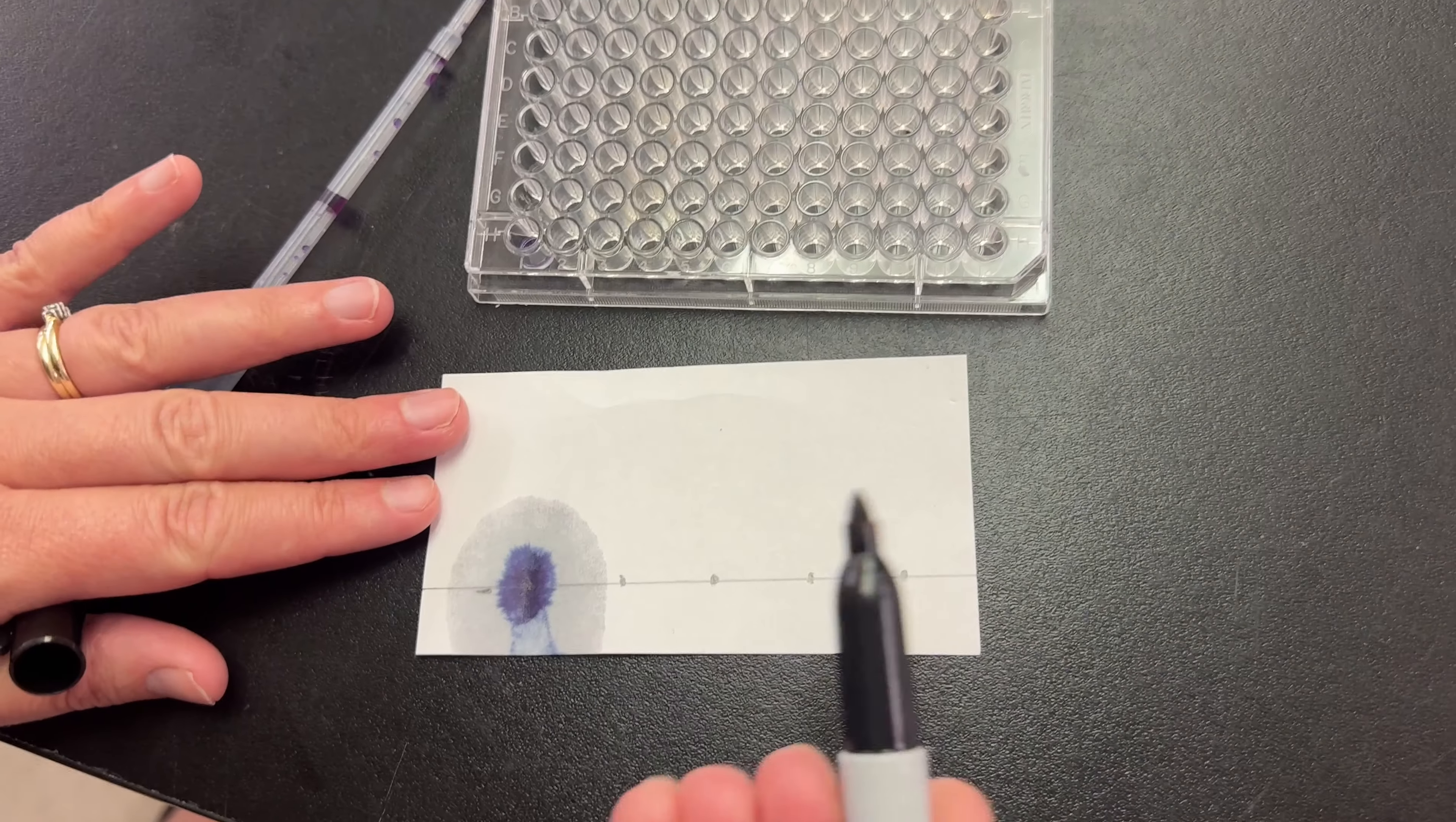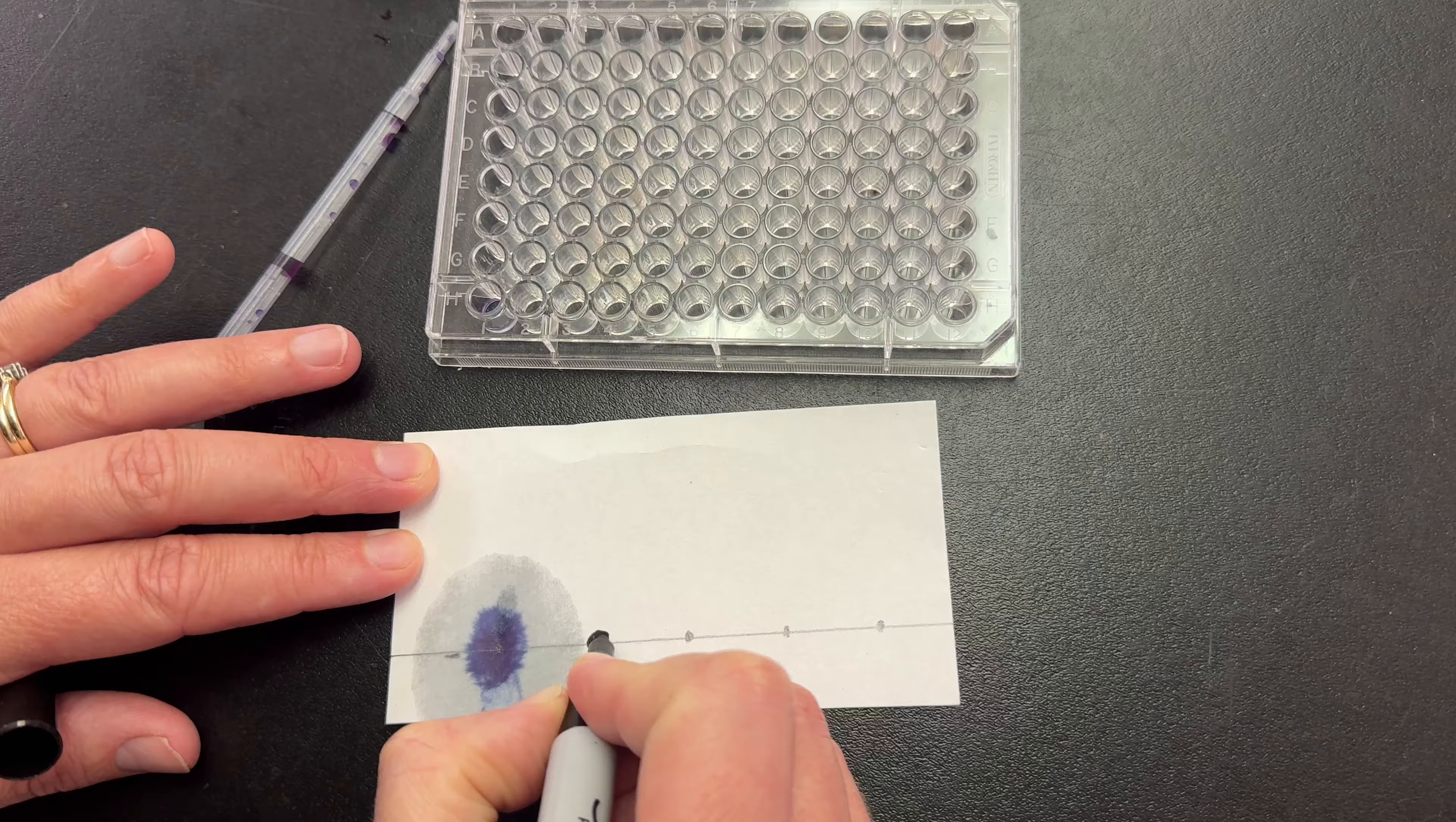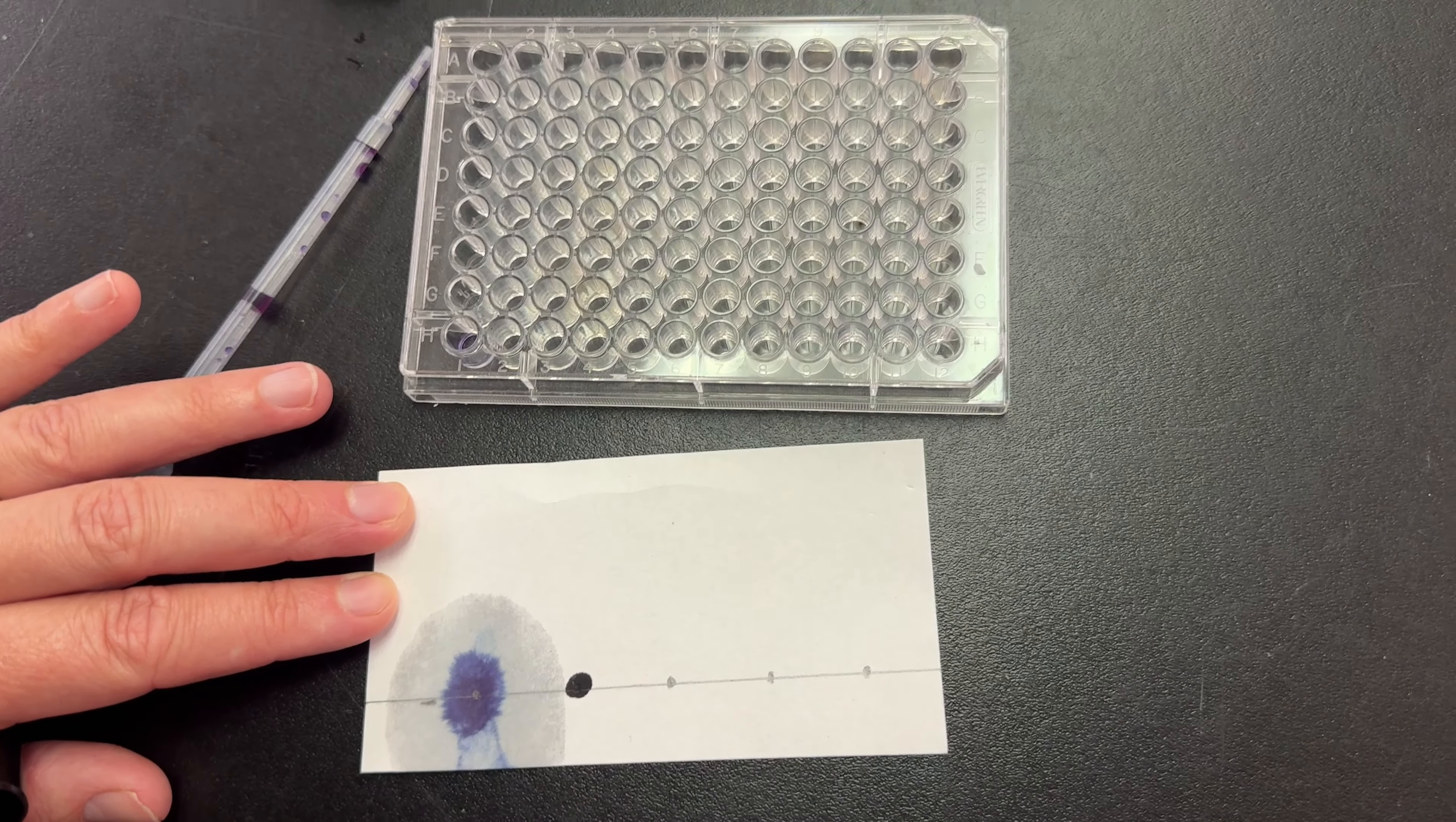Step three: while the paper is drying, use a black felt tip pen to put a dot about three millimeters in diameter on the second spot.